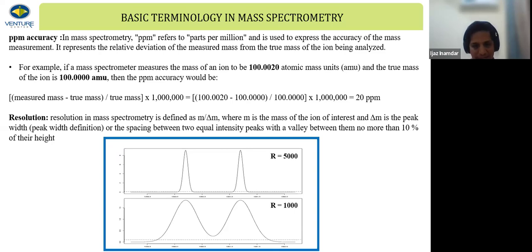But your managers might say, you have achieved 2, but go to 2.5 at least. So that in future cases, if somebody else is doing it, or if the system changes, it doesn't drop down to 1 point something, it doesn't go below the acceptance criteria. So minimum acceptance criteria is 2, but you develop up to 2.5 to make some adjustment for the future. If there is some drop in the resolution, at least it will not go below the accepted norm. So this is the resolution basically.